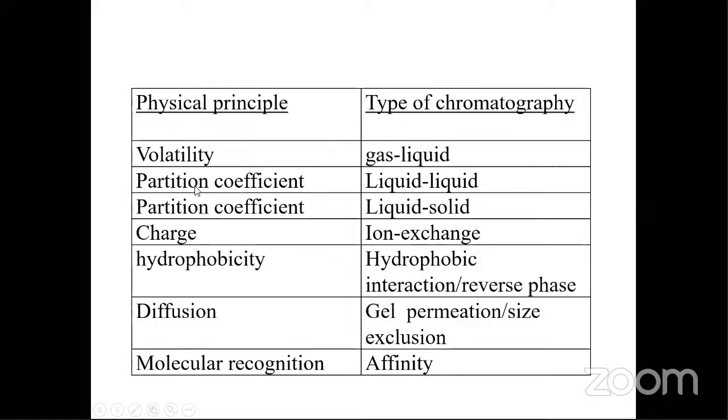If you have a partition coefficient based separation, we have liquid-liquid chromatography. If it's based on charge, we can have ion exchange chromatography. If it's based on the hydrophobicity of the protein, we can have hydrophobic interaction or reverse phase chromatography. If it is based on diffusion or size, we can have gel permeation, gel filtration, or size exclusion chromatography. If it's based on molecular recognition, it's affinity chromatography.